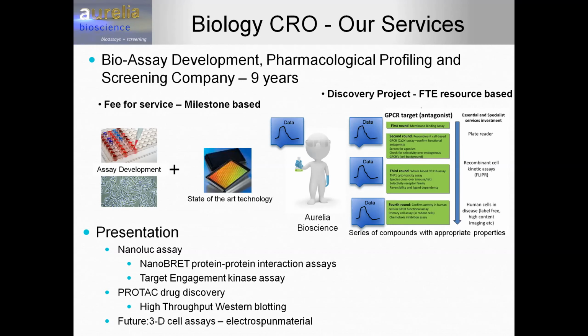I'll go through some of the projects that we've been looking at in terms of PROTAC and how we've been doing that, and then the future of cell-based assays, and more specifically looking at something we call Electrospun material.